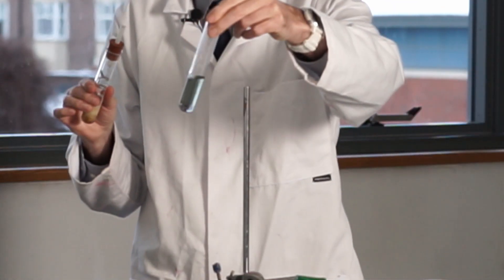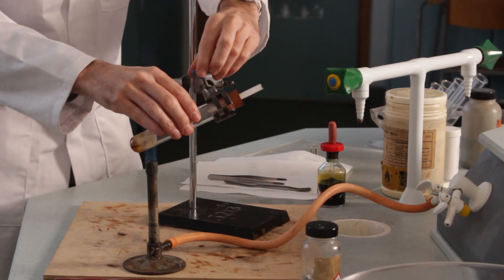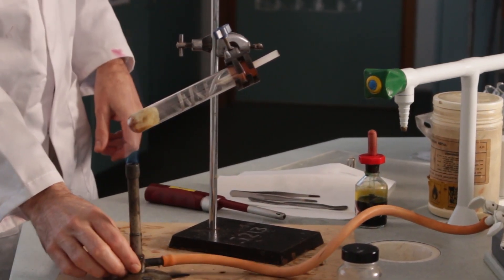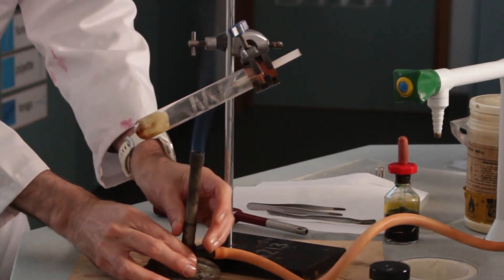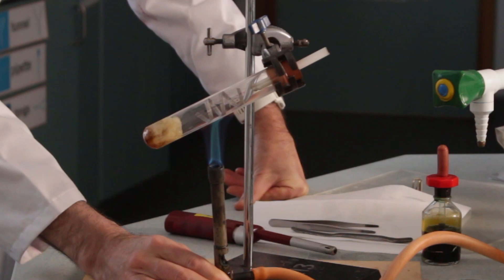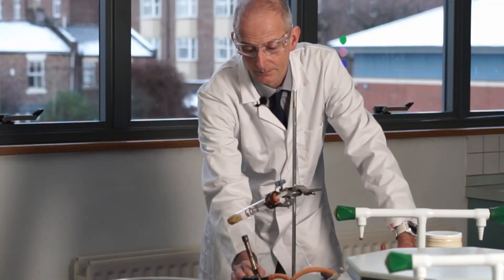We managed to get magnesium to react with hot water, but it wasn't very spectacular. What happens if we try magnesium with steam instead? I'm going to clamp it near the top of the tube. I'll move the Bunsen around — heating it strongly here so you can hear the roaring flame — to get the magnesium nice and hot, then every now and again move the flame down to get the water turning to steam, alternating between the two.